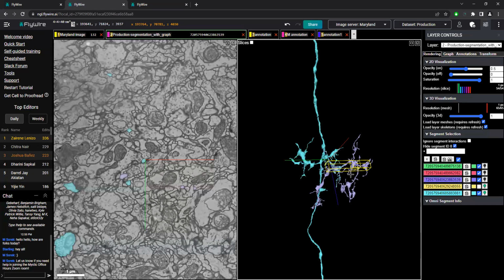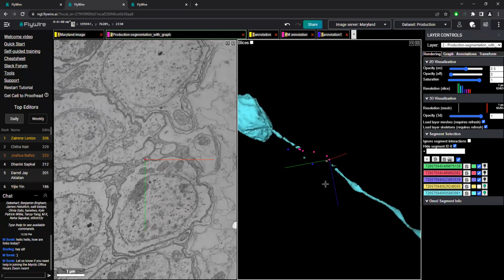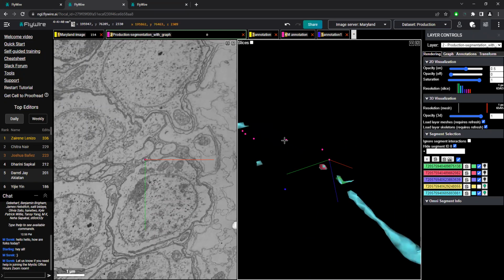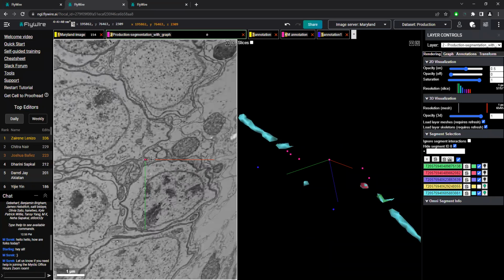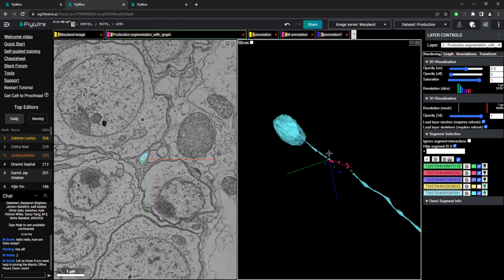And if there's anything you want me to go over, I can talk about how we're using annotations a little bit more for jumping. I think I gave you the example of leaving a little kind of breadcrumbs, since we can't select any segments here. That's not highlighting anything until later. Then we can add them in.